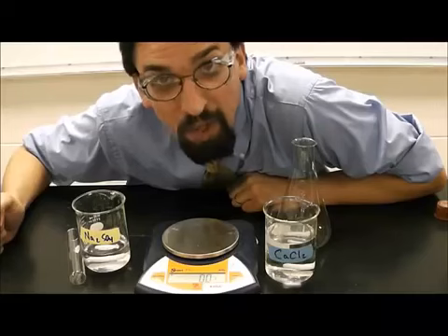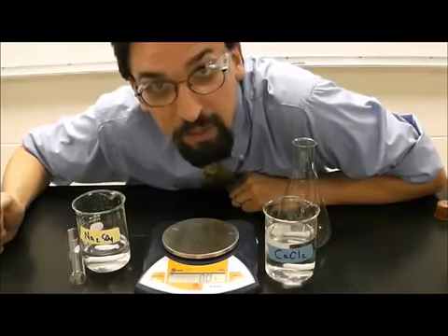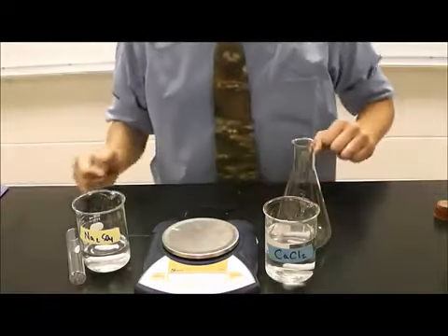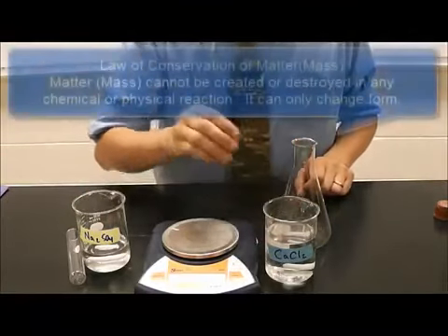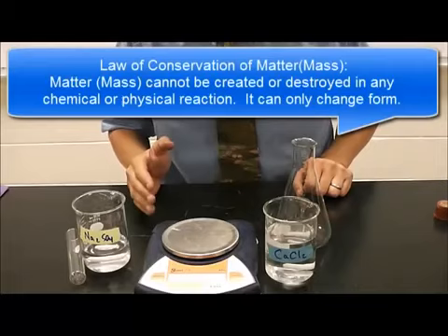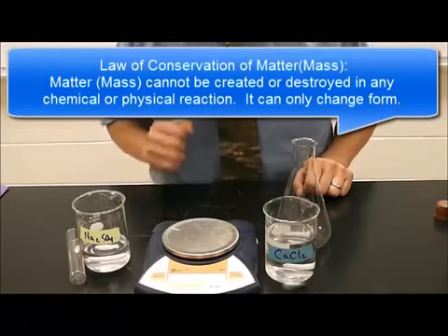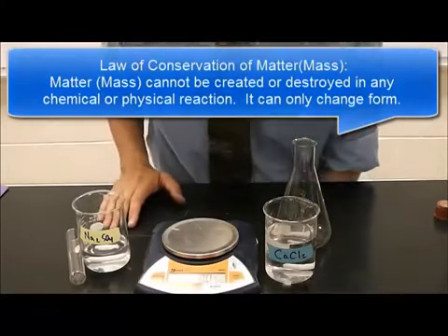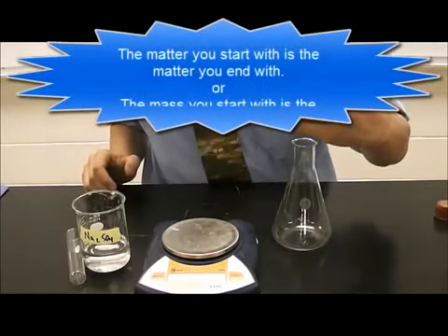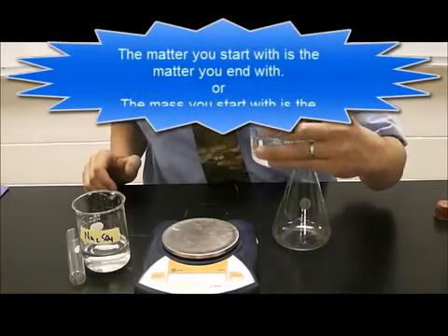This is going to be the law of conservation of mass, or law of conservation of matter, depending on which way you like to talk about it. So the law basically says that in any chemical reaction, matter or mass is conserved. It cannot be created or destroyed. That means that when you start a chemical reaction, the mass before and the mass after should be the same.